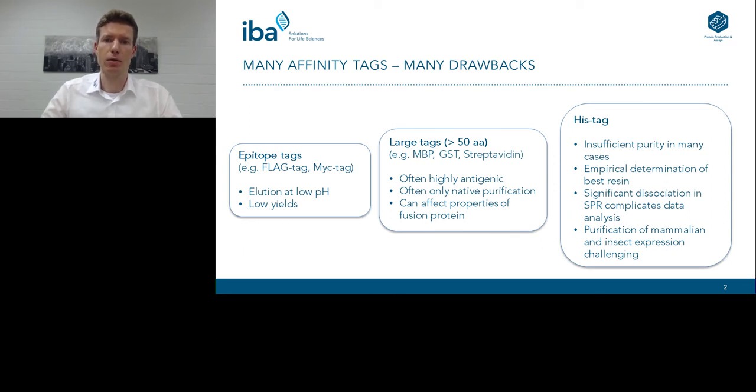So the most widespread tag system on the market is the HIS tag system, because it's a cheap system and the binding capacity of the resins is high.